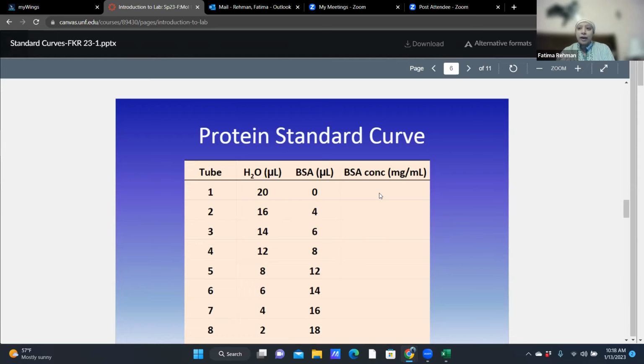So once I add the Bradford reagent to it, I want to make sure that the water was not contaminated with protein and doesn't give any blue in it, right? But also whatever absorbance I get from that sample is my background noise from the assay in my plate reader. And I need to subtract that from all the other absorbances before I start working with my samples. So that's the one that I'm going to subtract from everything else to get my blank corrected absorbances.